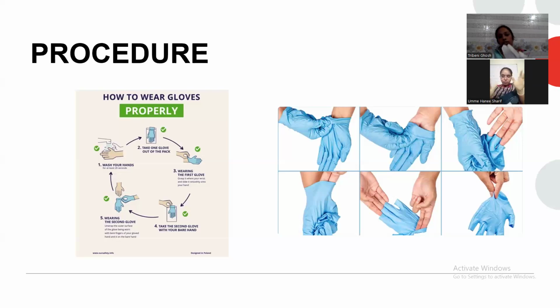So let's do it again. Just pinch this part and grab it. Okay. Then with your hand like this. Now all the upper side of your gloves is inside. And now discard that in the bins. Yes, I have done it right now, I think. Then I have to discard it in the proper place, and then I have to sanitize my hand.